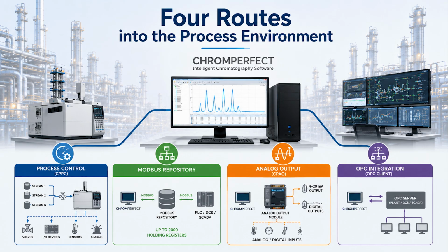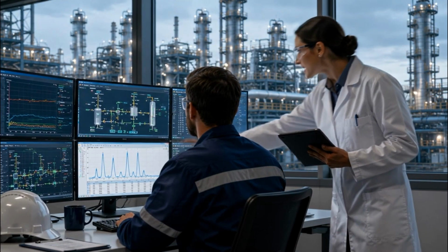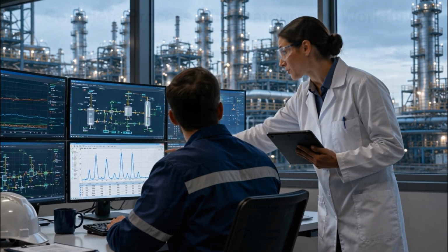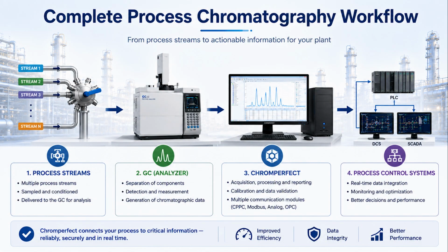Together, these capabilities allow Chromperfect to operate as more than a laboratory data system. They allow chromatography to become part of a wider process monitoring and control environment while preserving the analytical methods, calibration, processing, reporting, and data records used by the laboratory.